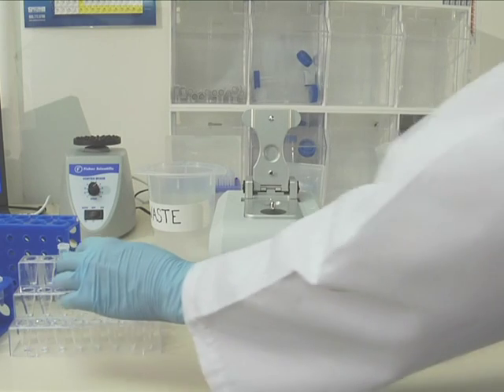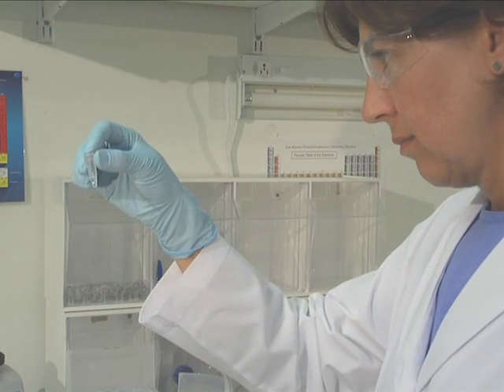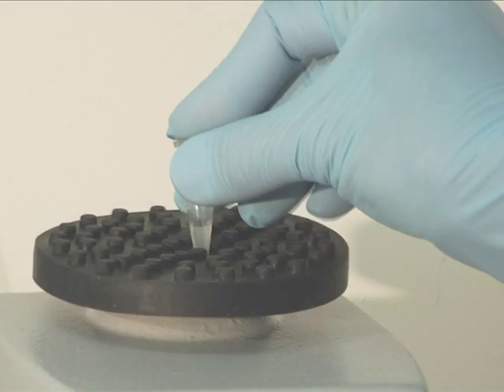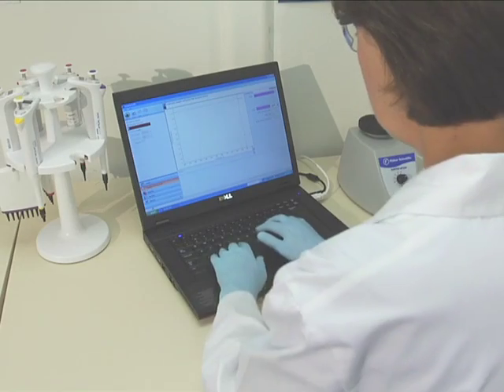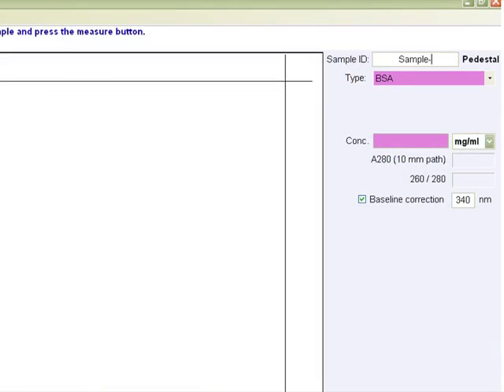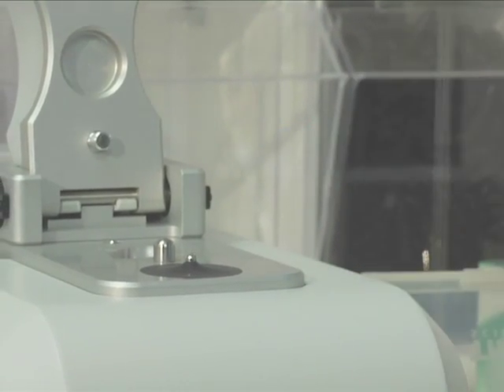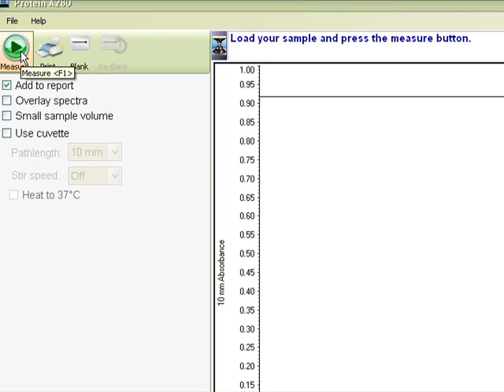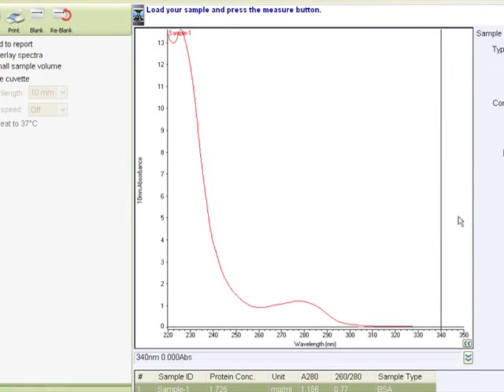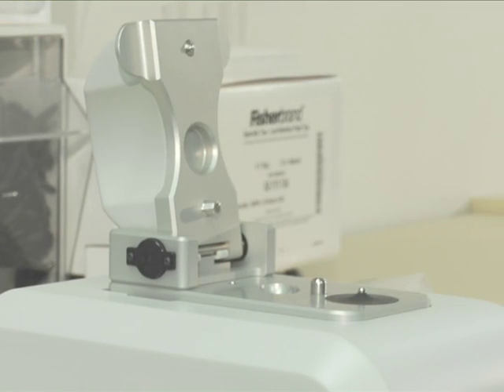When blanking is complete, wipe the blank solution from the lower and upper pedestals using a dry laboratory wipe. Prior to taking an aliquot for measurement, it is important to ensure that the sample is homogenous. Mix the sample gently but thoroughly by gentle vortexing using a mid-level RPM to avoid introducing microbubbles into the fluid. Enter a sample ID in the appropriate field, load two microliters of the first sample, lower the arm, and click measure.